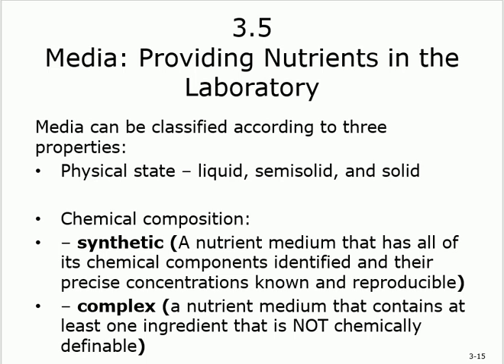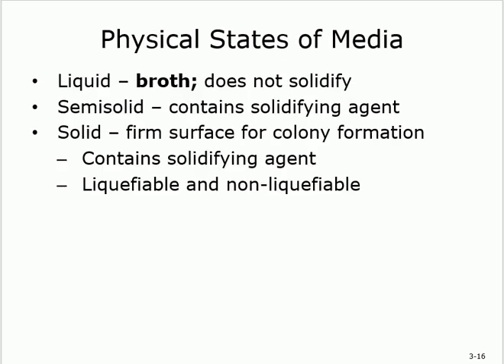All the numbers are known to you. Or it can be complex, means you don't know everything about it. So according to the physical states of the media, it can be liquid, it can be solid, it can be semi-solid. Liquid is like broth. And remember that the liquid does not solidify. It will not become solid.